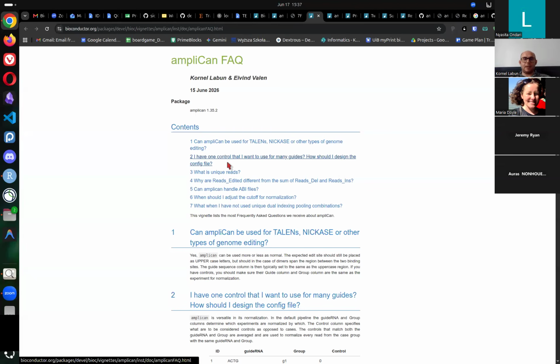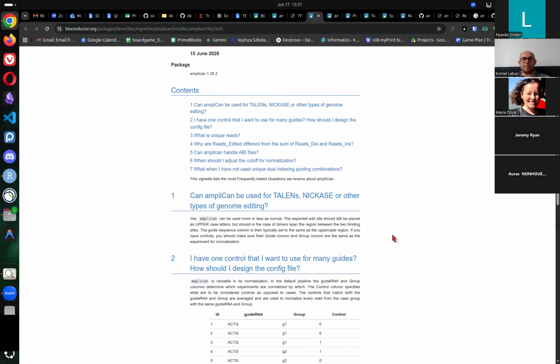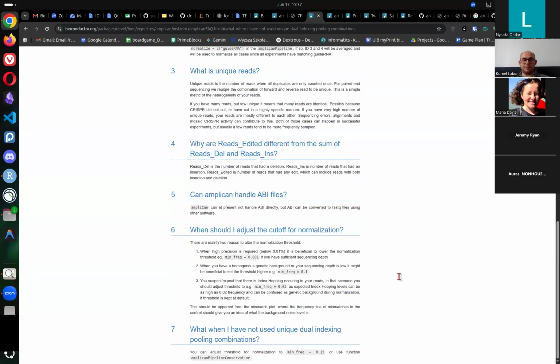You can actually do a lot of controls. We'll go through that. And these are some other questions that people are asking. What can I do when I don't have complicated files, right?